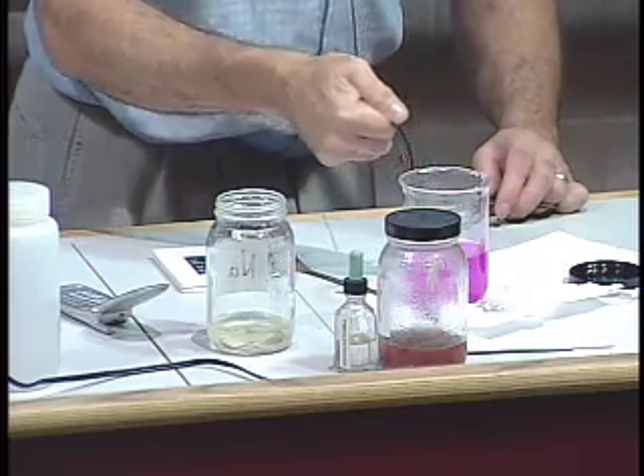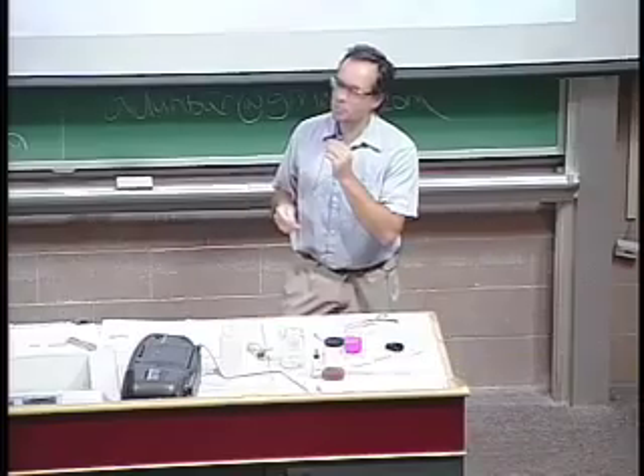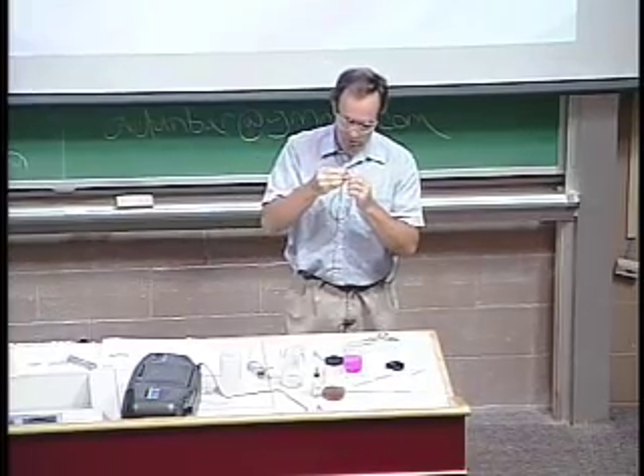It's making a neat noise too — it sizzles away. This is the type of reason that firemen want to know what's in your lab before they come. If you've got some of this in your lab, spraying water is not a good idea.